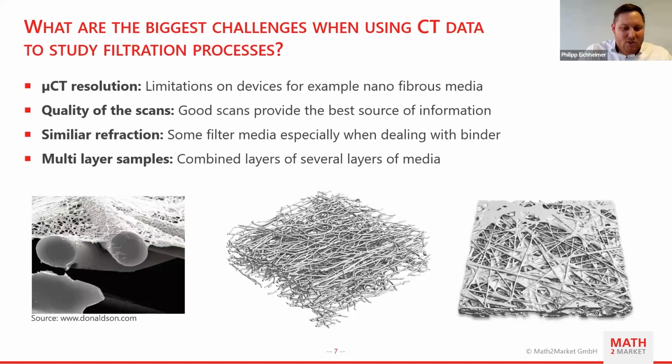To resolve this issue, we would, if possible, do scans with good quality of each of the layers, and then we can stick them together in the software. This is possible, and then we have a good quality and can also do a good analysis later on. Are there any questions?